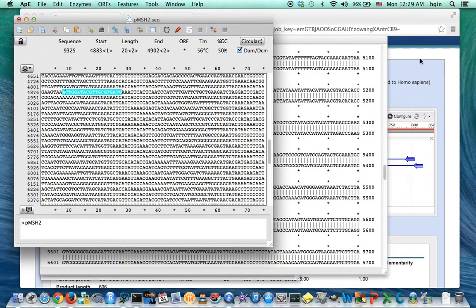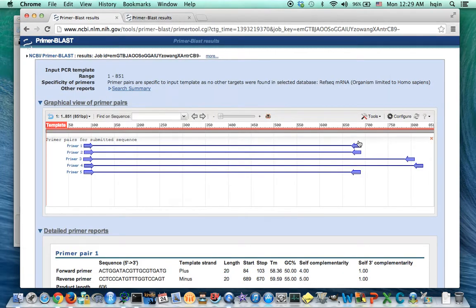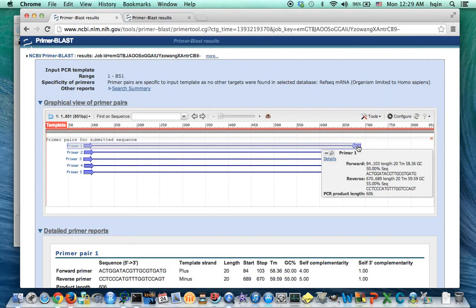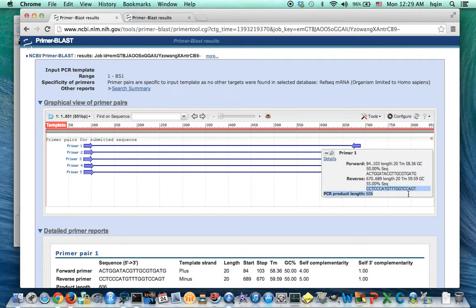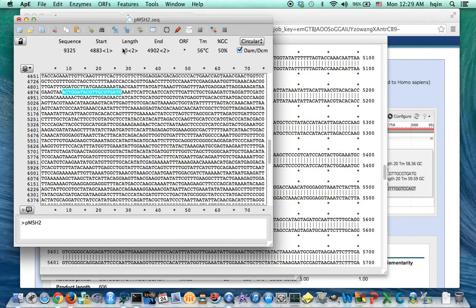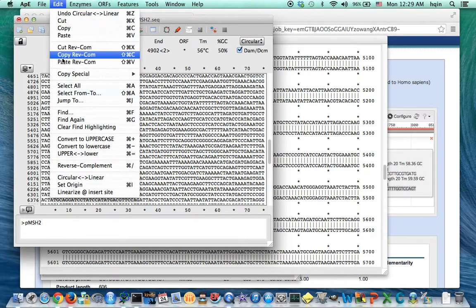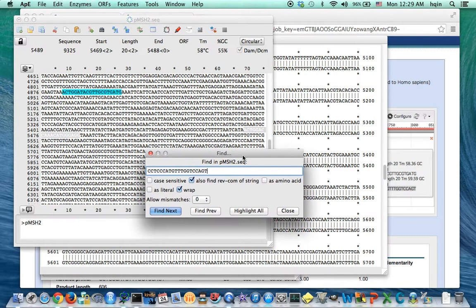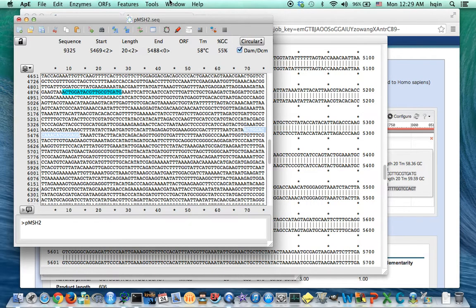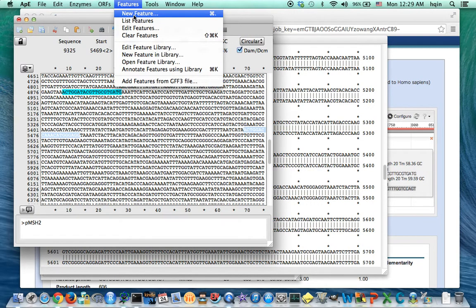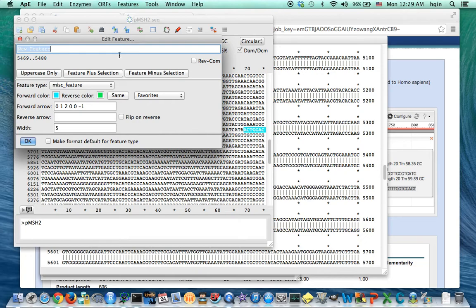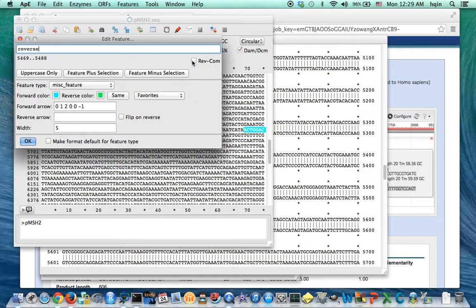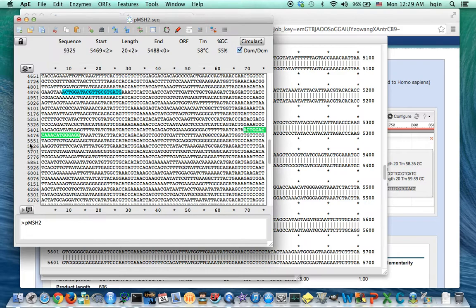And then I go back to the NCBI website, look for the reverse primer. That's the reverse primer. Copy. Go back to APE. Again, find. So it's around this region. Close this. And then go to feature, new feature. So this is my reverse primer. Make sure you click reverse complement because that's going to label the opposite strand.